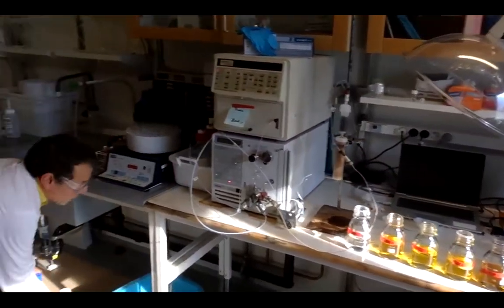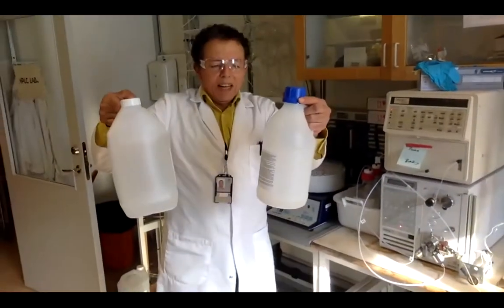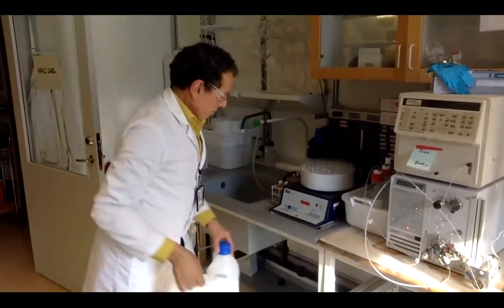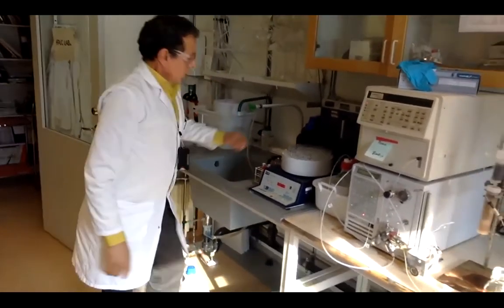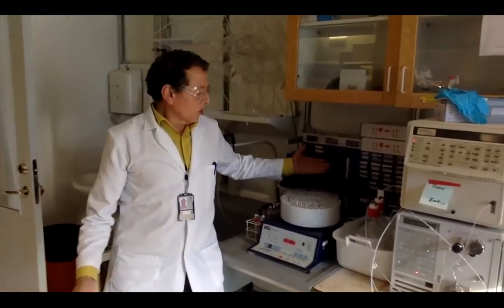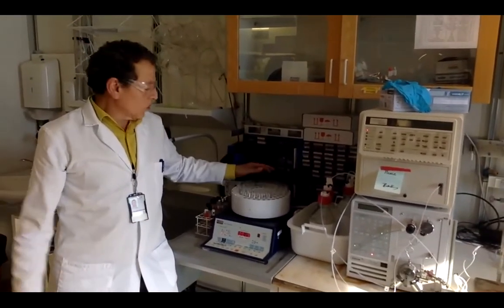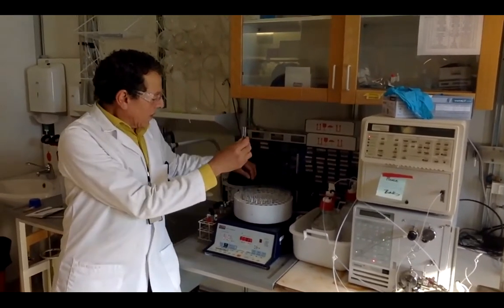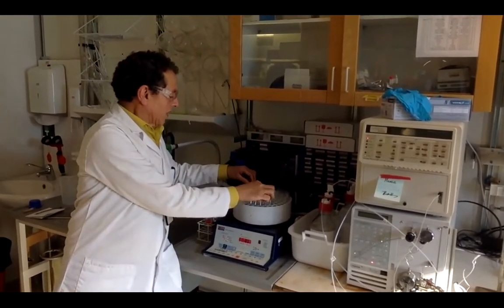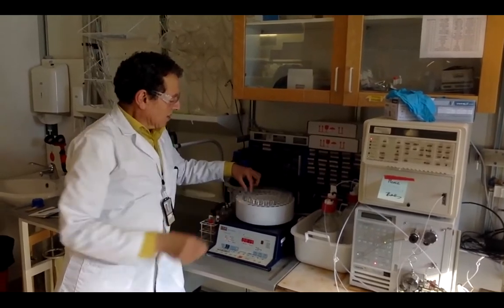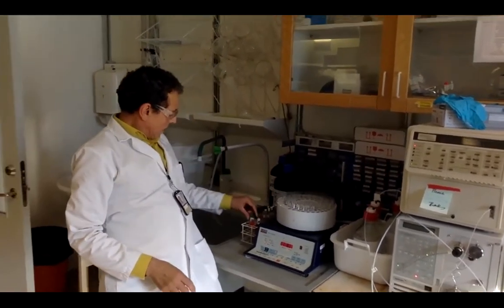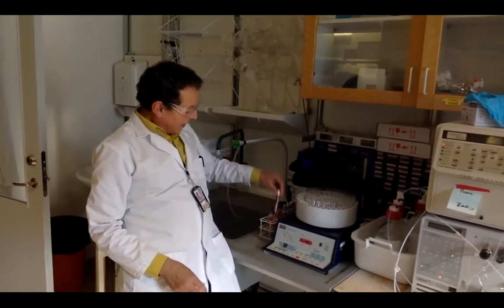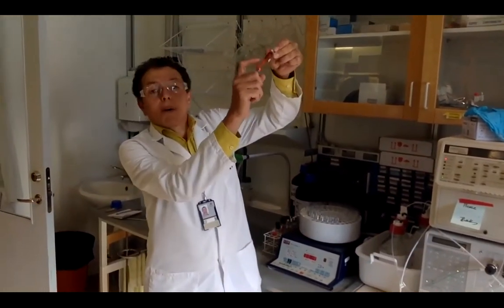Additionally, we can use normal grade of the solvent. On the other hand, you can use a fraction collector according to the method. It can be from 60 to 110 tubes. In this case, you can even get pure compounds directly. This happens with us in some compounds, which we get as crystalline like this compound.